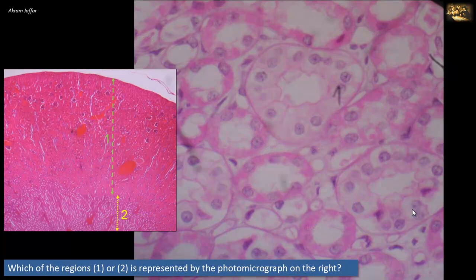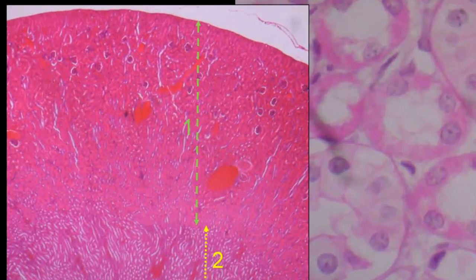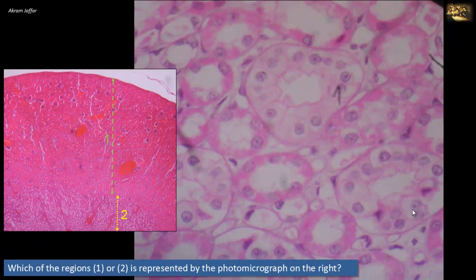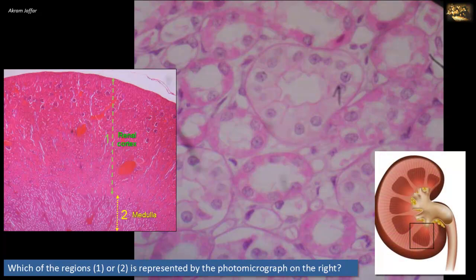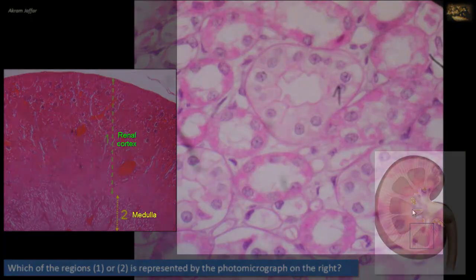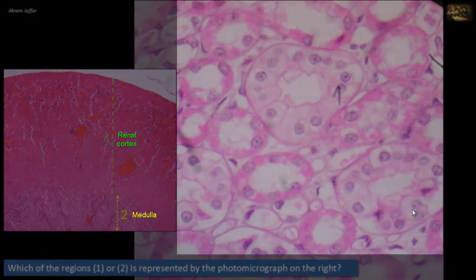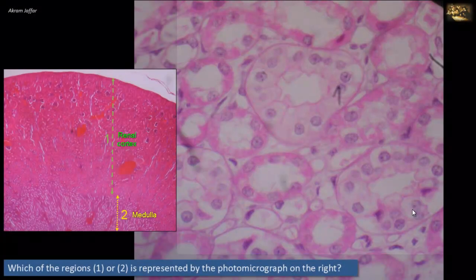Which of the regions — one or two — is represented by the photomicrograph on the right? The photomicrograph on the left shows a section of the kidney where region one represents the renal cortex, showing multiple renal corpuscles, whereas region two is the medulla. Note that in the medulla only tubules can be observed. The slide on the right shows multiple circular profiles of renal tubules. Some have a very thin wall lined by simple squamous epithelium, representing the thin limb of the loop of Henle.